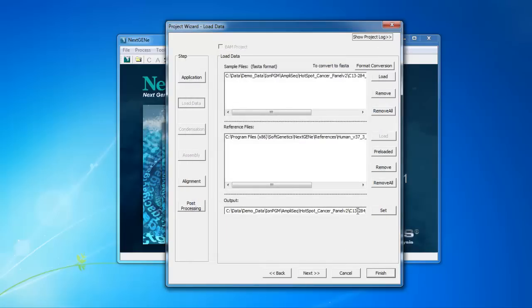Here, the output destination is automatically filled in, but you can again edit the location as needed. Then click Next.